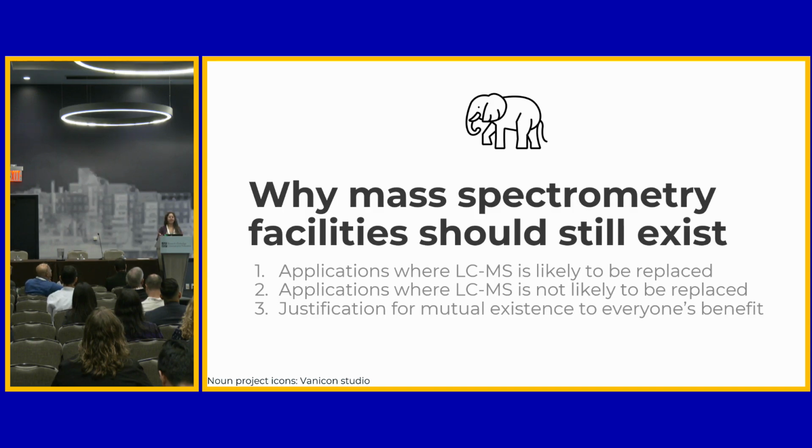We heard a great talk about SomaLogic. Brian just told you there's all these other options out there which maybe have their pros and cons. Why should a mass spec facility still exist? I want to talk very briefly about where we're going to be replaced, where I think we're losing ground in that customer segment and why. And then we're going to talk about where we're, I don't think, going to be replaced.